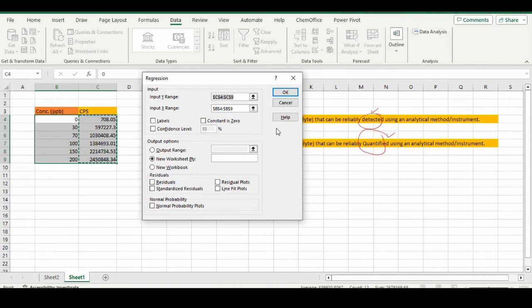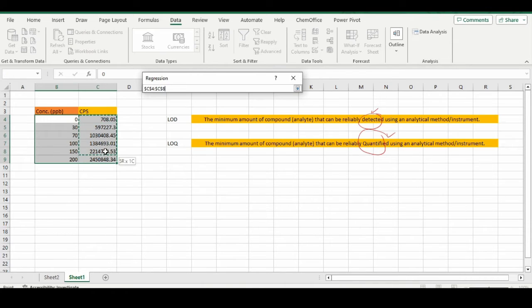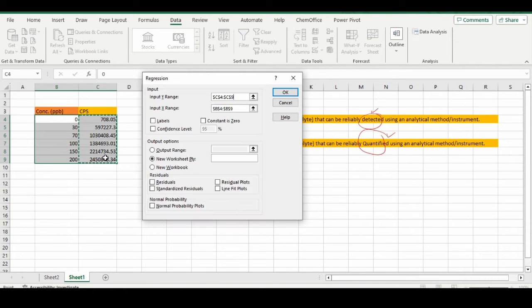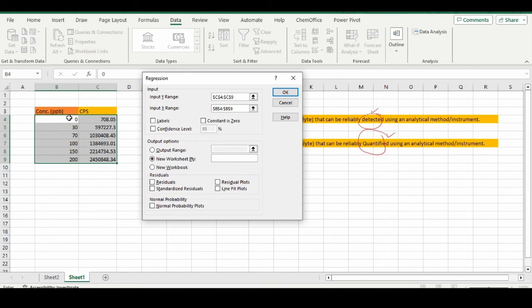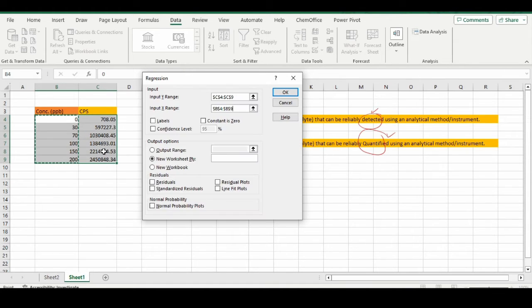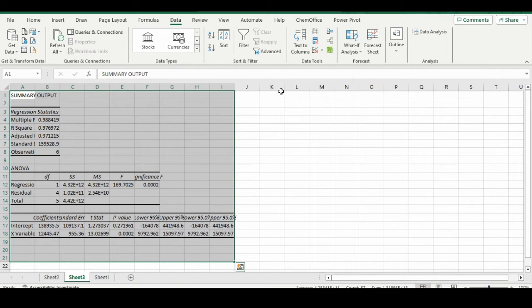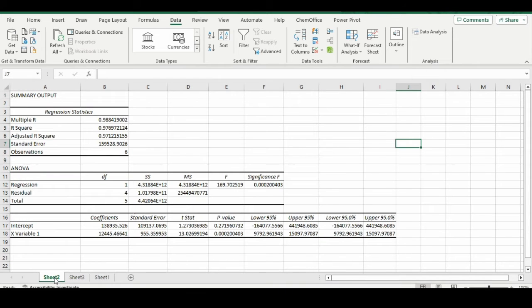When you select Regression, it will ask you what are your X and Y values. These are my Y values—be careful when selecting X and Y values. For X values, I have these values. When I press OK, a new sheet will appear.